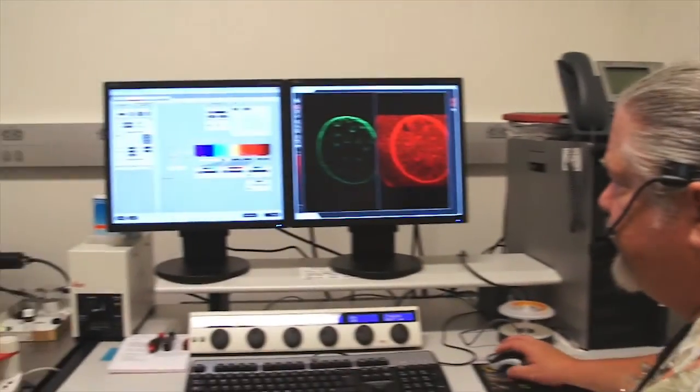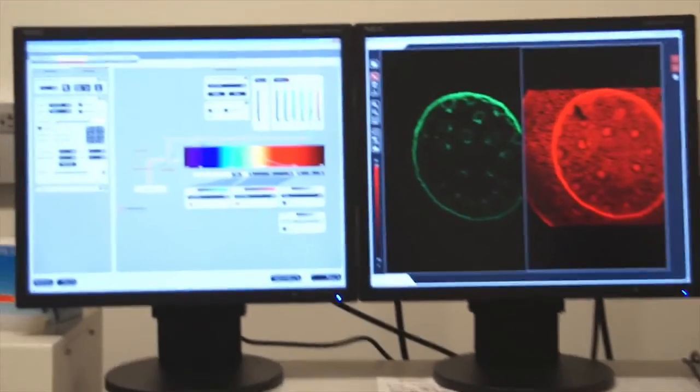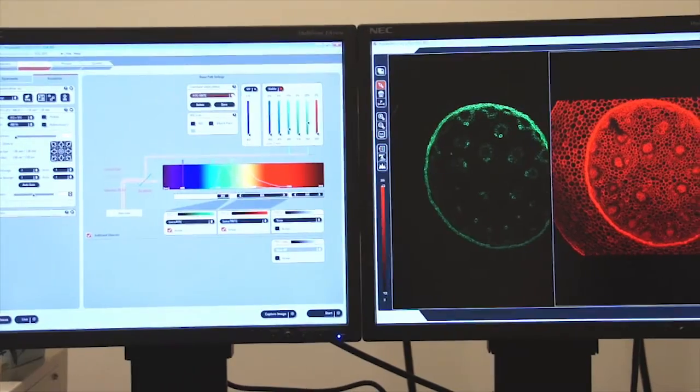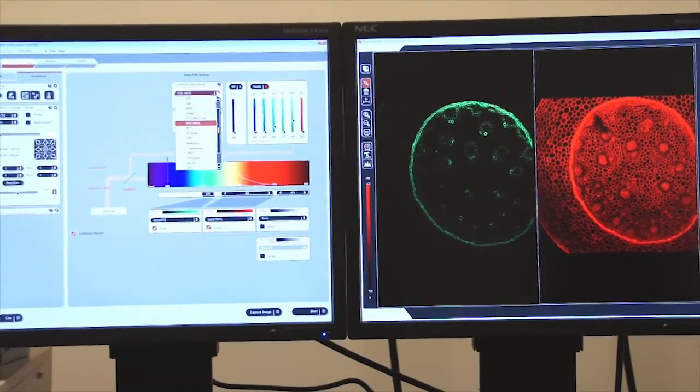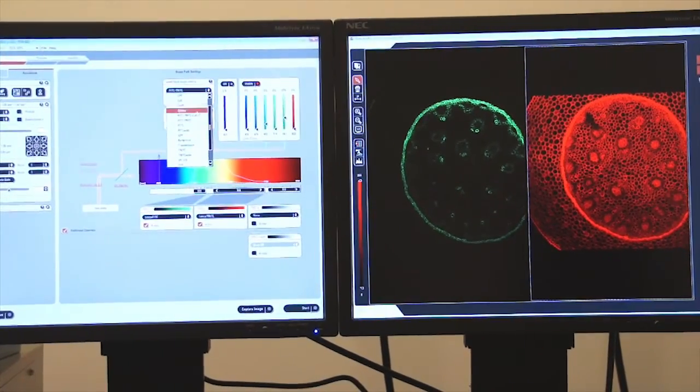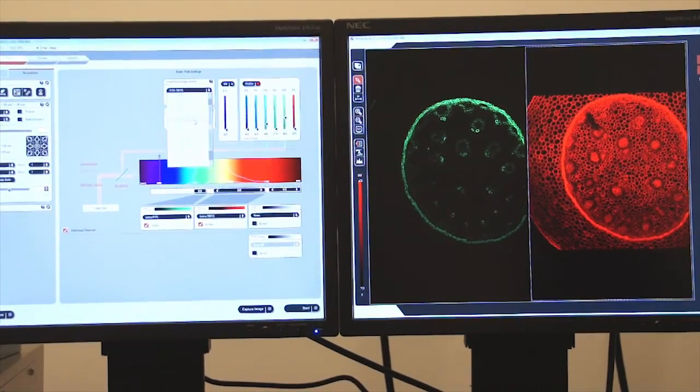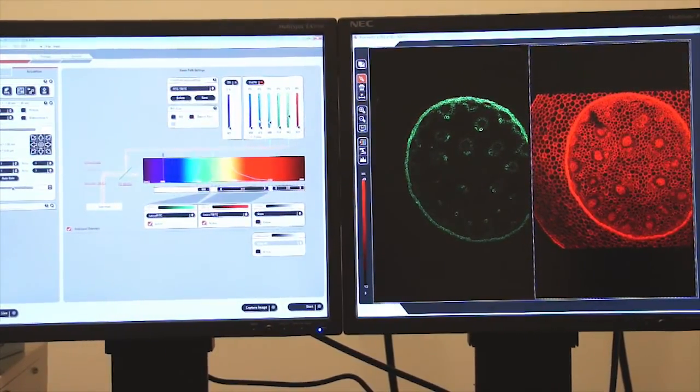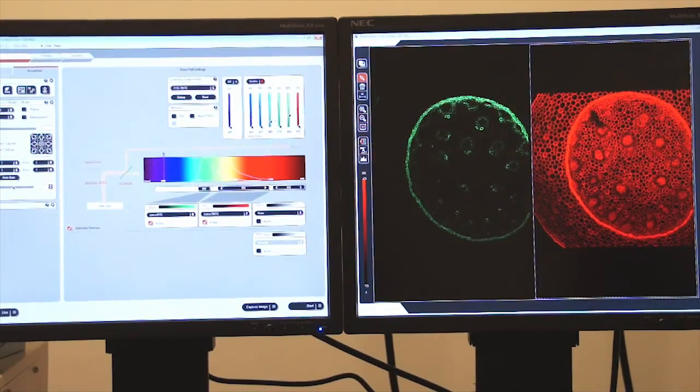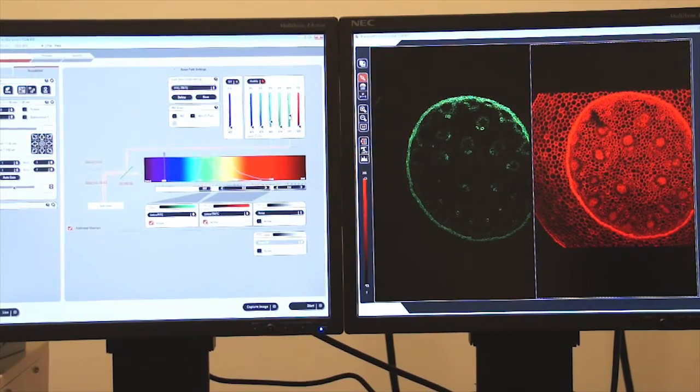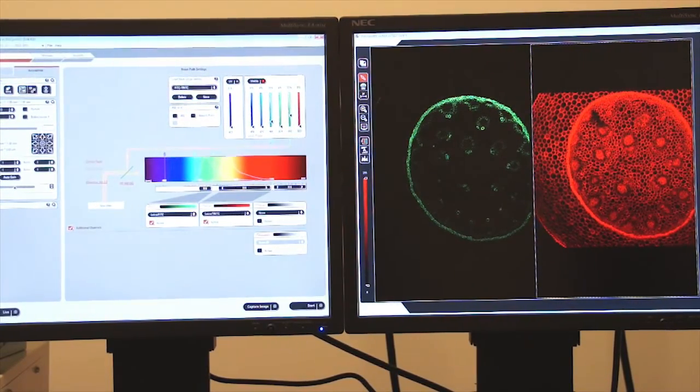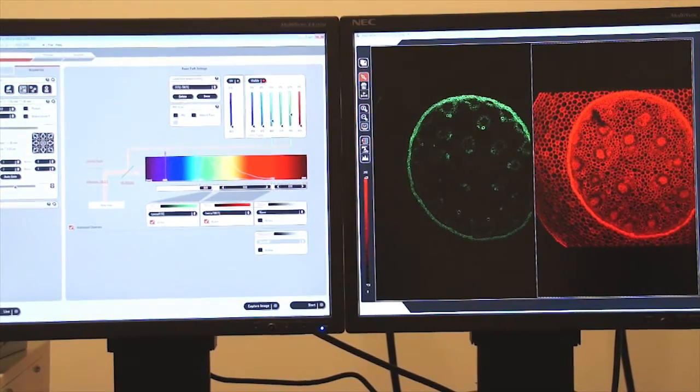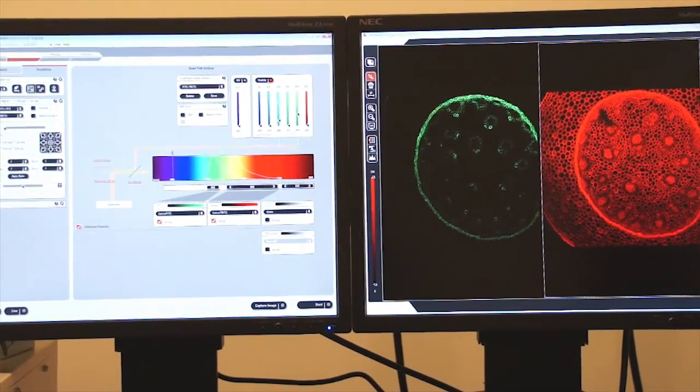In this case, we have selected Fitsy Tritsy from our pull-down menu, which activates the proper lasers with the proper amount of power. It turns on the photomultiplier tubes.